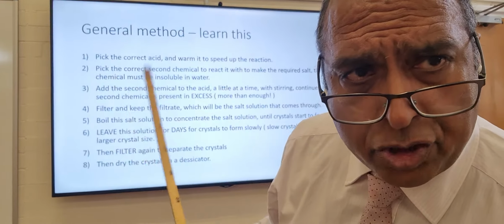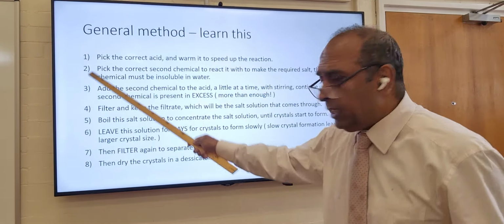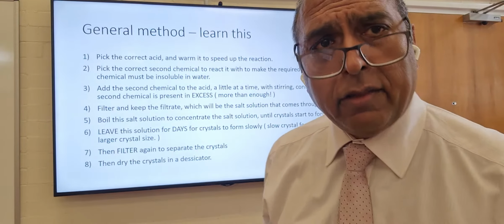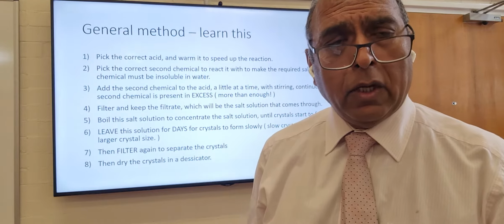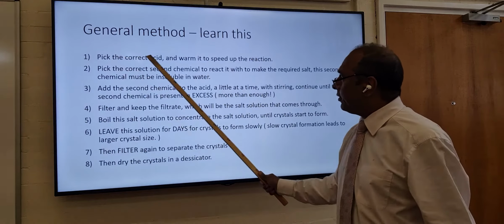What is this general method? There are about 8 points to it. You need to learn this method. So we were trying to make copper sulfate. Pick the correct acid.